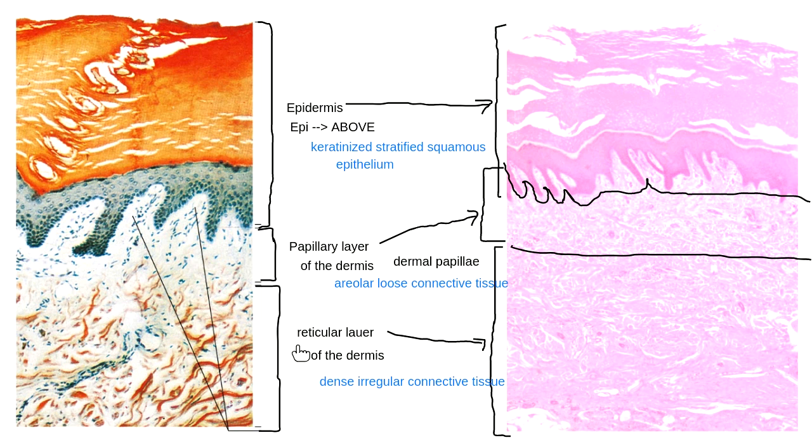So save some mind space there. Learn these 3 tissues, learn their location in the skin as the location you're memorizing. Remember, by the way, that dense, irregular connective tissue is really messy. I can see all these really messy proteins down here. I can see the really messy proteins over here.